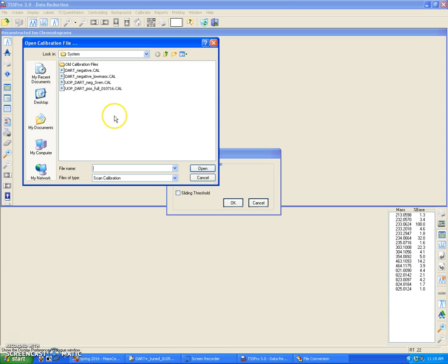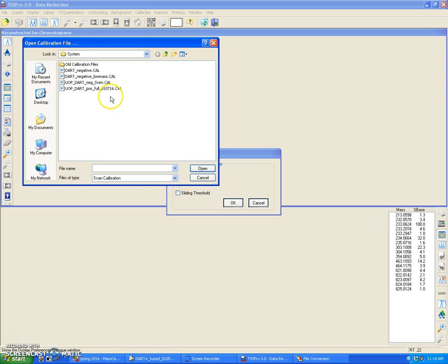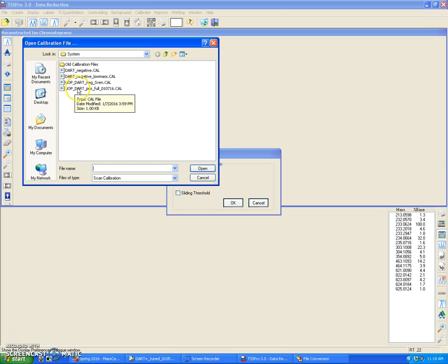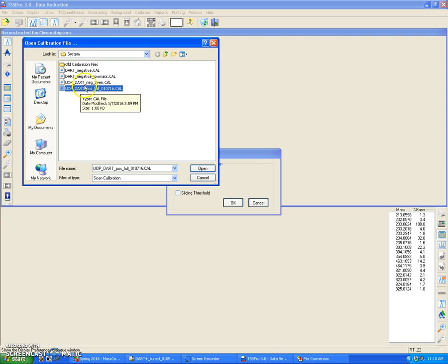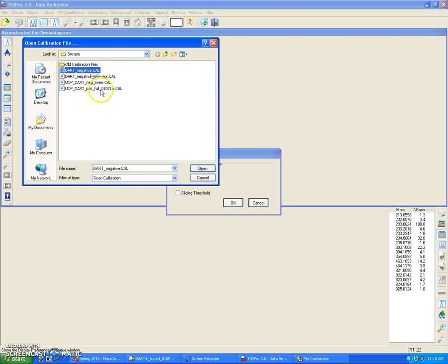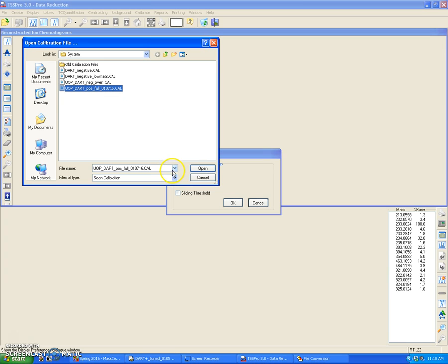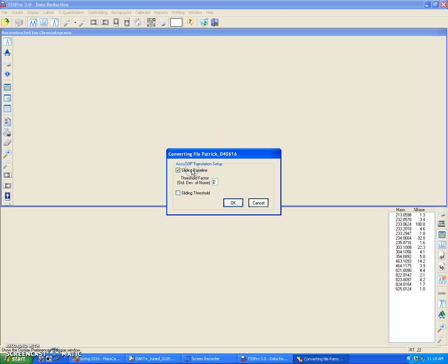Two windows will pop up. The first window is the open calibration file. And what this is are the mass assignments, the default mass assignments for your data analysis. In this case, I use the positive ionization mode with the Dart ion source, so I'm just going to select that. If you use the negative ion source, or if you use negative ion mode on Dart, then you can click on any of these. But in my case, I'm going to open the positive ion mode calibration. I'm going to click Open.